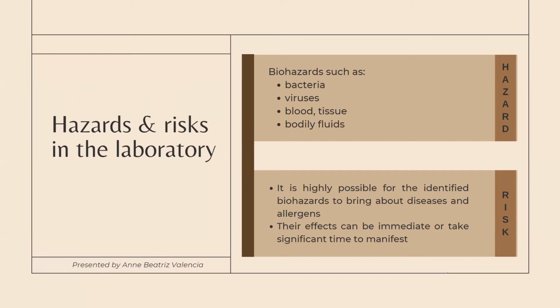These materials can all carry disease or hazardous allergens which could put the lab team at risk. The effects of the disease and allergens can be immediate or take significant time to manifest, demonstrating the importance that all members of the lab team are given sufficient protection, even if the dangers are not yet known.